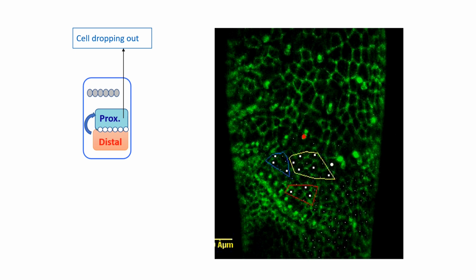In this case, now we know that it's cell death, but at that time we just knew that they disappear from the epithelium. I'm going to show you an example. I'm going to play this movie, but first I'm going to explain this. Every time that you see in the movies that you're going to analyze these big squares, those are cells that we labeled and we were able to identify that they died. So here you will see all these cells that will disappear during the rotation. And we encircled them in three groups just to make it easier to see.